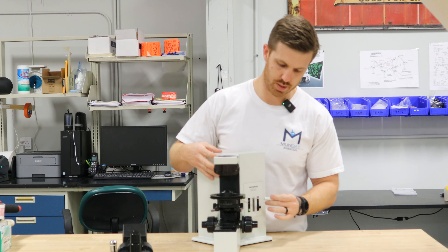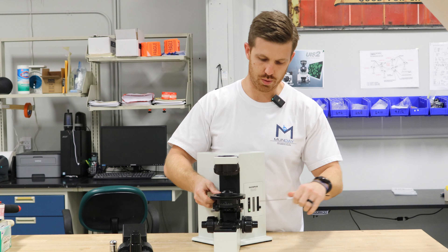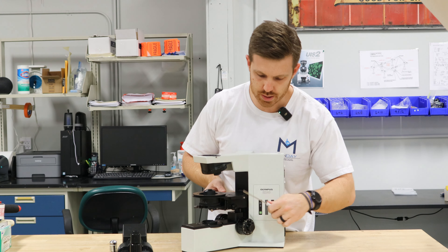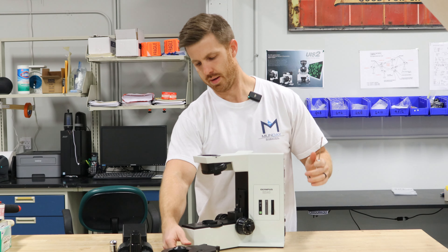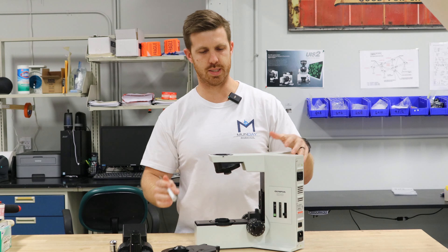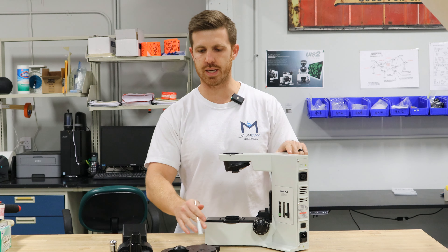Use the same Allen wrench to loosen this bracket here — your substage bracket — and that slides right off. Now the microscope is disassembled and it's ready to be packed and shipped.